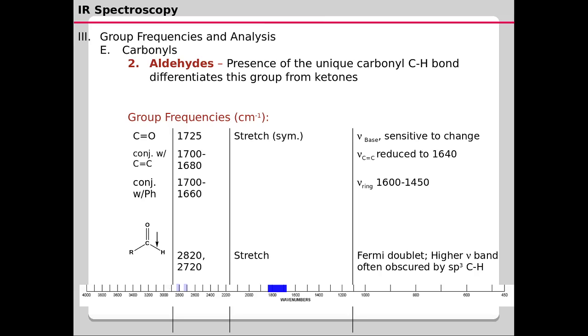The carbonyl functional group usually shows the stretching frequency at 1725 cm⁻¹, which should be considered only as a base value, and it could be changed due to reasons such as hydrogen bonding, resonance contribution, and inductive effects.